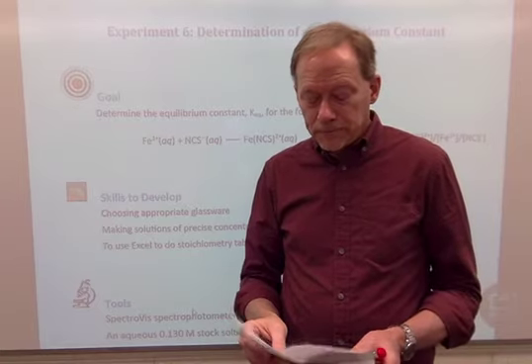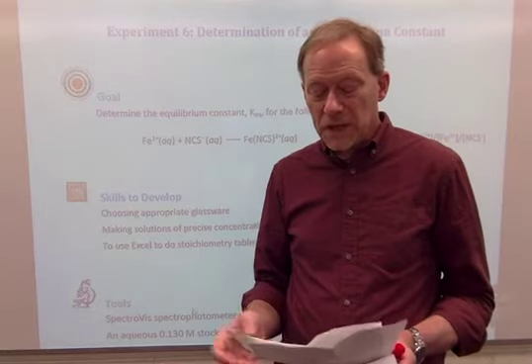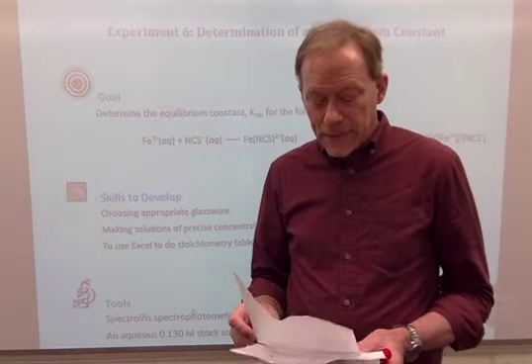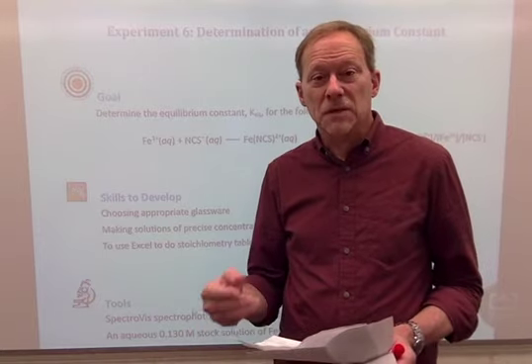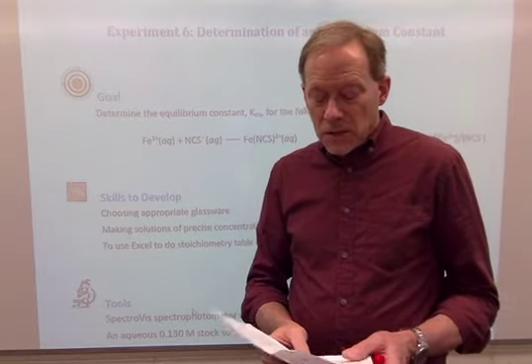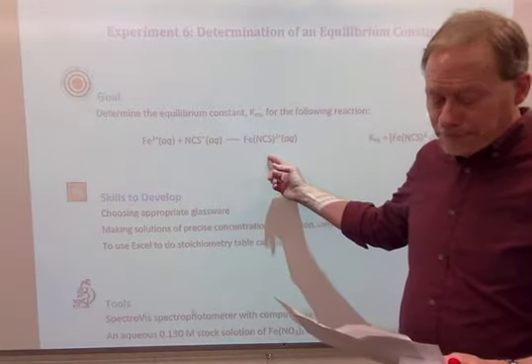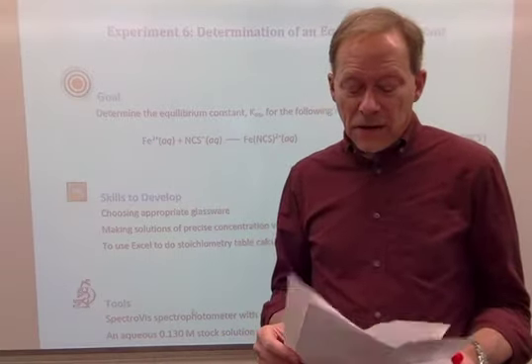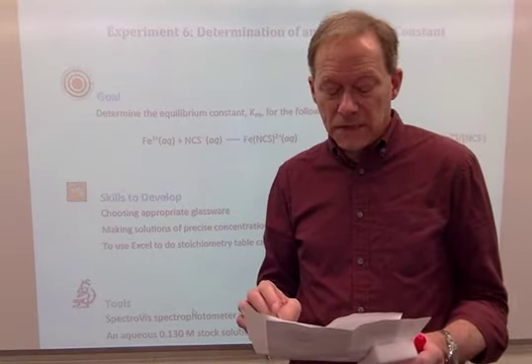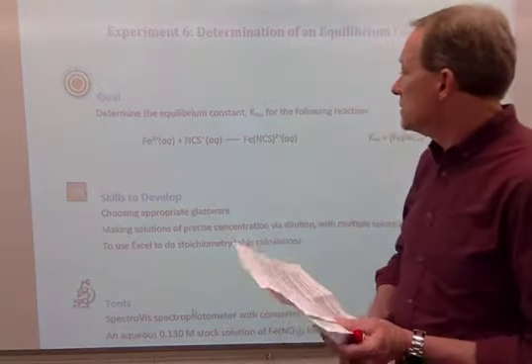So what we're going to do in our lab activity today is support the concept of chemical equilibrium that you're getting in the classroom. We're going to do it through lab measurements so you can put a different approach to understanding these concepts. So we've chosen an equilibrium that's represented here on the board. And it allows us to observe one of the chemical species by absorbance, because it's a colored compound in water. And the other species are colorless.